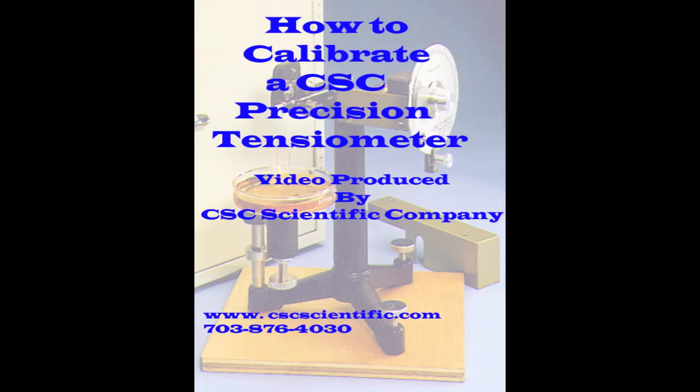Calibration of a CSC precision tensiometer, part number 70535. When you need to find out if your tensiometer is performing correctly, you need to check it against a known standard or perform this calibration procedure. The procedure is the subject of this video.